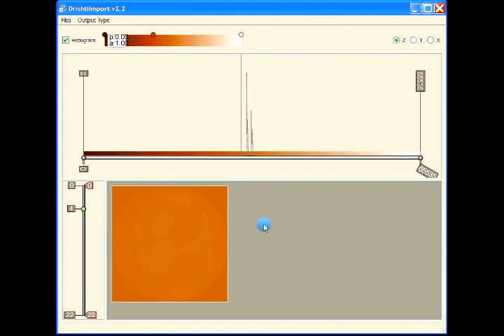You can also import 8-bit data and then save it as 16-bit data. It's no problem with that. The importer will allow you to do that. You can save integer data or float data into 8-bit as well as 16-bit data sets, and in your pvl.nc file, if you are saving 8-bit output, then it will be saved as unsigned char, and if you are saving it as 16-bit, then your data will be saved or remapped as unsigned short 16-bit. So that's how you can save 16-bit output using version 2.2 of the Drishti importer. In another video we will see how to load and work with 16-bit datasets in the renderer.